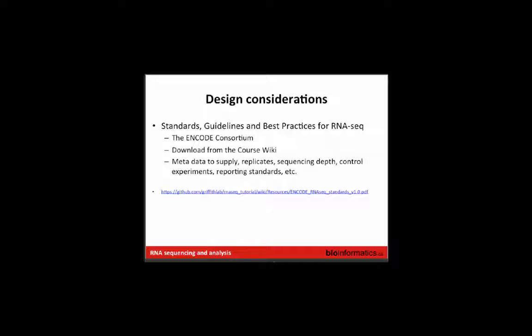It's basically a list of everything you should do, but that no one actually does. But you should think about doing some of those things that are recommended, because you may thank yourself later for including spike-in standards or sequencing to a certain standard depth and so forth.